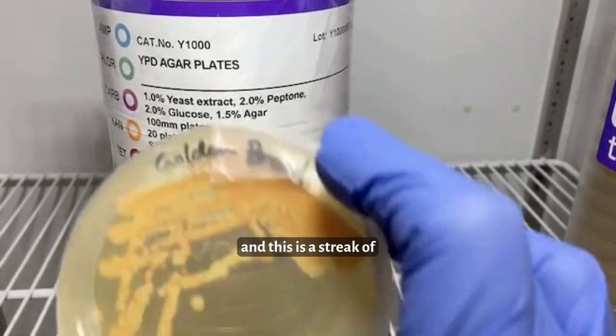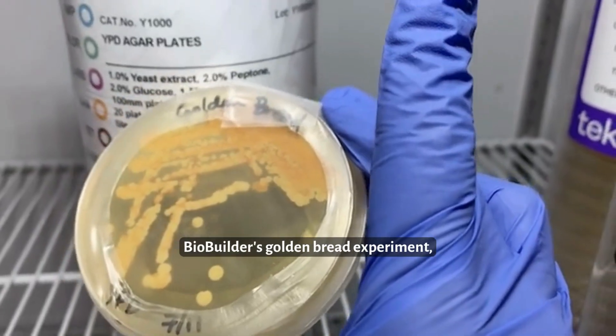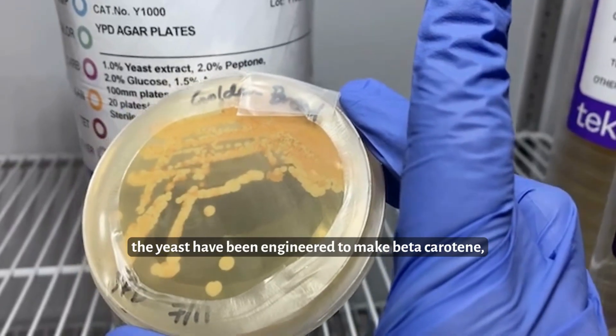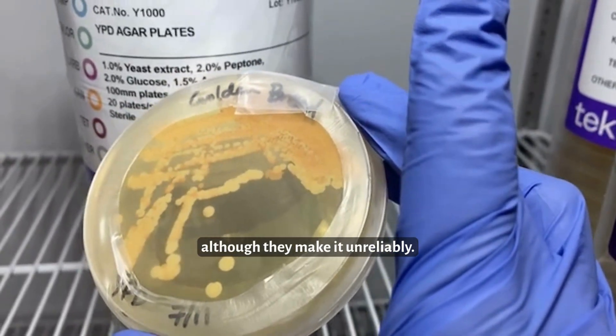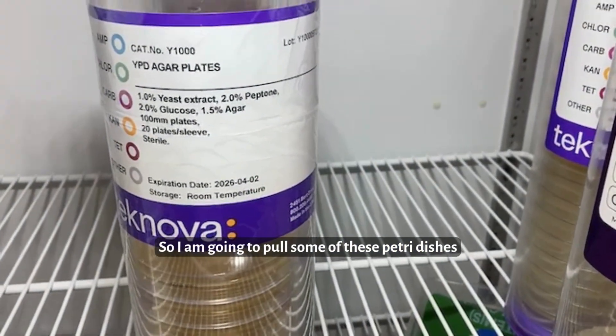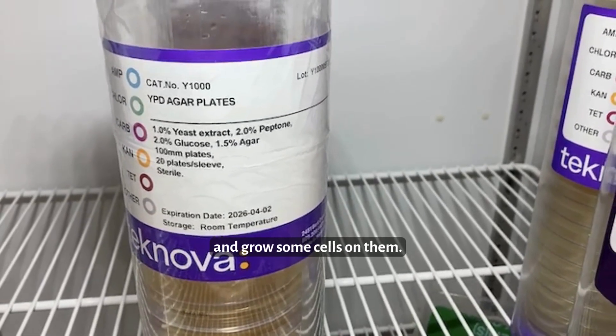This is a streak of the yeast that we use for BioBuilder's golden bread experiment — the yeast that have been engineered to make beta-carotene, although they make it unreliably. So I am going to pull some of these petri dishes out and start to spread and grow some cells on them.